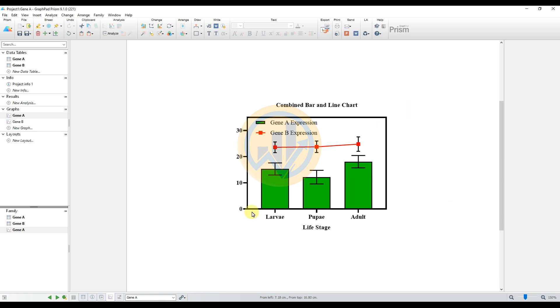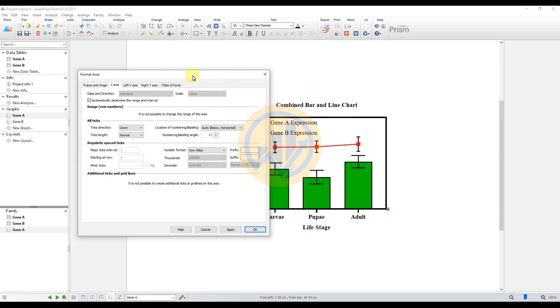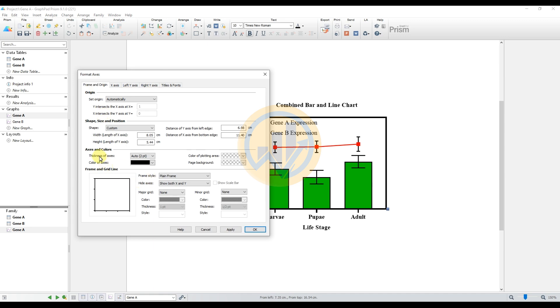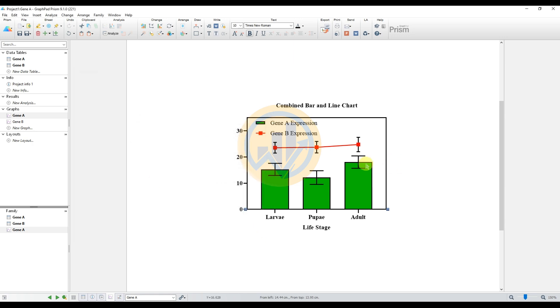Set the width factor to 2. Then double-click the y-axis column and go to Frame and Origin options. Set the line thickness of the frame to 1, then click Apply.